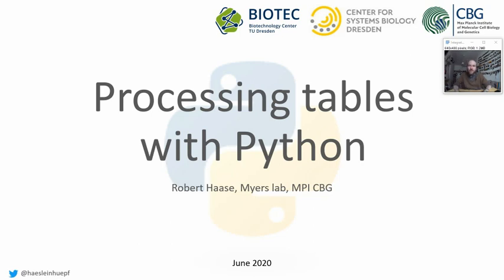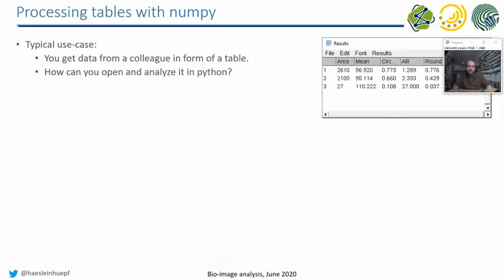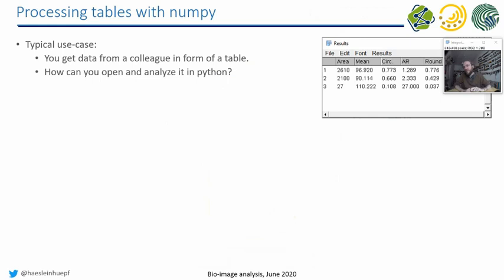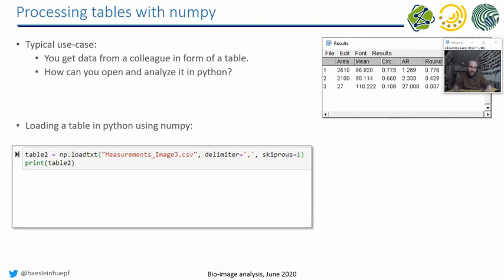And it's not so convenient, I mean really not done in ImageJ. It's more something people do in Python, and that's why I would like to show you a bit, very generally, how this works. So the typical use case is you get the data from a colleague, or you analyze it yourself in some images in ImageJ, and you save this table to disk. The question is now how to open and analyze tabular data in Python.